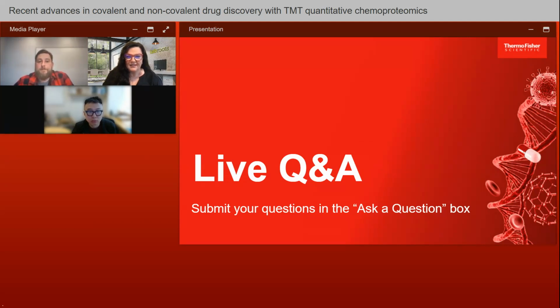All right, fantastic. Another question here: what drug discovery projects are better suited to use DIA or TMT with CETSA experiments? Thanks again for the question. TMT provides you with exceptional quantification precision, and you can go as deep as you have time for into the proteome.